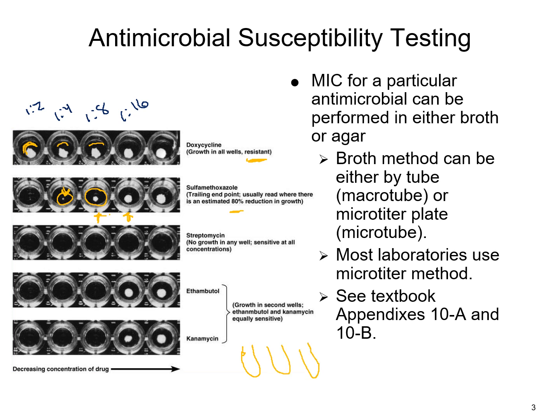You introduce the bacteria, making sure the amount is equal in each. Then you're looking for turbidity or cloudiness, or even just a clump of bacteria growing at the bottom. So you can do susceptibility testing a few different ways.